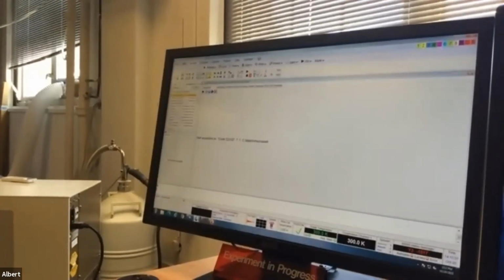So that's why we're going to take the crude, and then we're going to run one more sample, but we'll log out, and I'll just post the data for that sample. But we'll stay logged in while the crude is running, because I want you to see what the leftover salicylic acid, where that shows up. Yes. All right, it's coming. It takes a while to shim.